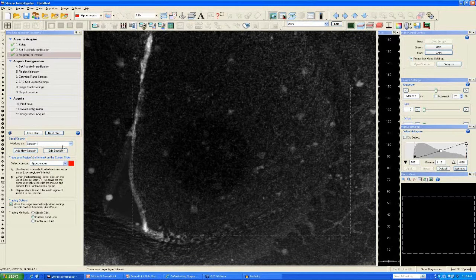This is a good place. The serial section list lets me decide or select which tissue section I am working on. If my slide contained more than one tissue section and I wished to draw contours around more than one tissue section, I could select which section here. Alternatively, I have the option to add a new section now or edit information about the current section.